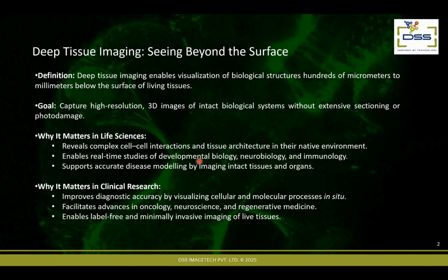So even though most of the usage of the multiphoton system is restricted to life sciences, it is now emerging as a potential diagnostic tool in clinical research. For the moment, it is mostly used for studying, for example, spheroids, where drug studies can be done. And since spheroids are really large structures, standard confocal microscopy, as I'll explain in the next few slides, is not enabling us to image deeper. So that's one thing that can be studied in terms of preclinical research.